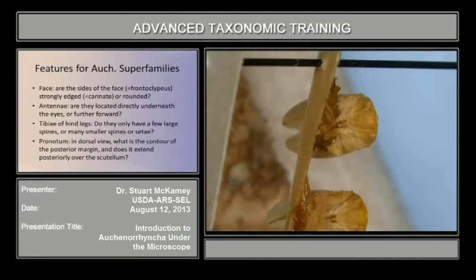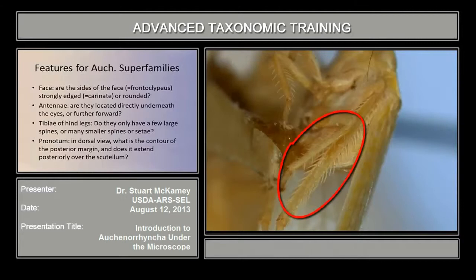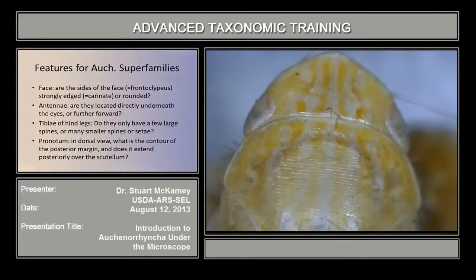The face, often most visible from a ventral view. The antennae, the hind tibia, and the pronotum, which is the dorsal segment behind the head. There's a mnemonic for these, which is FATPIG — F-A-T-P — the face, the antennae, the tibiae, and the pronotum.